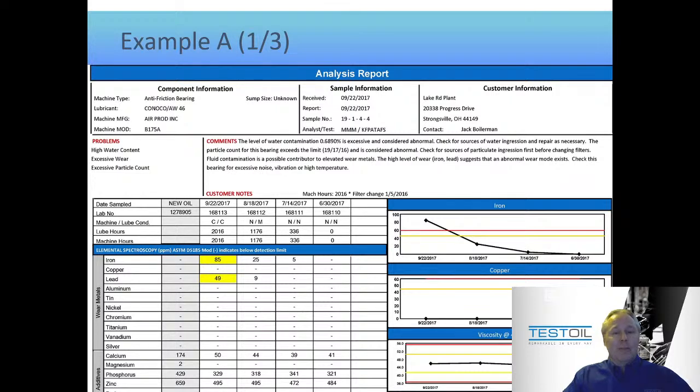And a lot of people stop on calcium, right? They look at this calcium value and they say, well, wait a minute. That's significantly different than the new oil value. I think that looks abnormal. And, they're not wrong, but I don't think it's a concern. And here's why I don't think it's a concern.